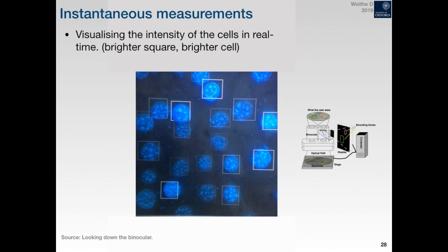This is what I was asked by the reviewers as well. These computer vision algorithms are very good at being scale invariant because they're used to photography where people can appear very close to the camera or very far away. So during the training, you actually change the scale of your image. I haven't got anything to show you about how well it works, but from what I've've seen, it's very good going between different microscopes and different objectives.